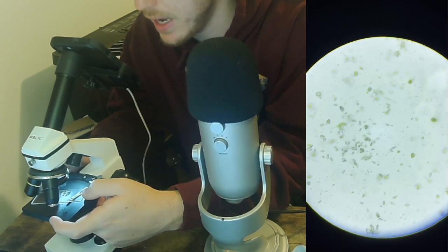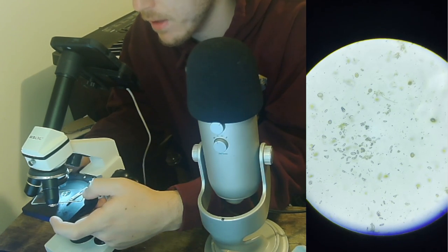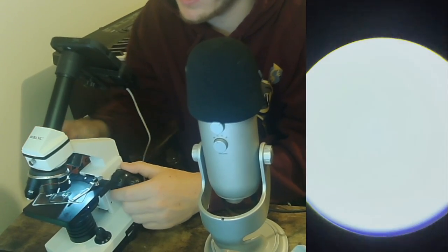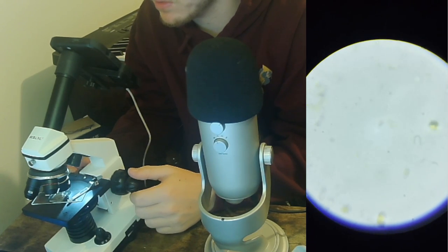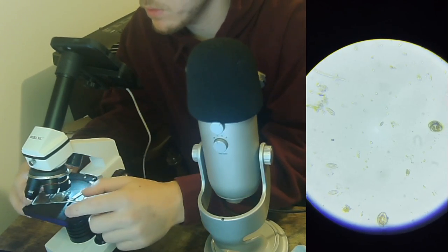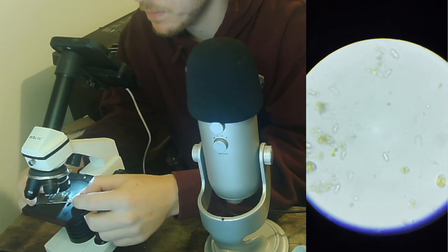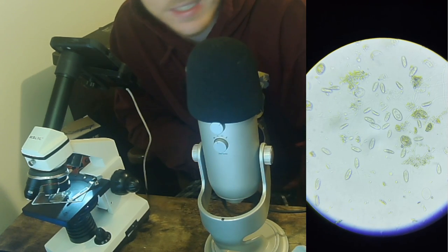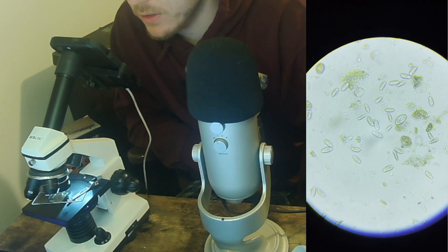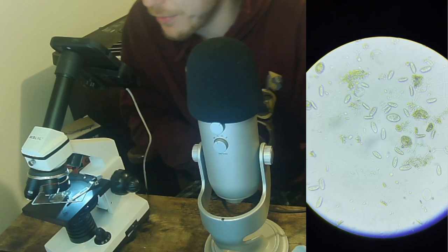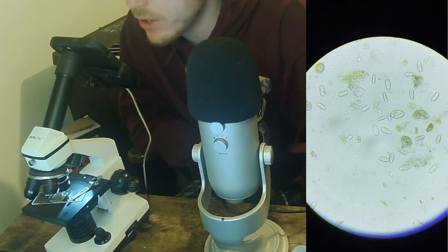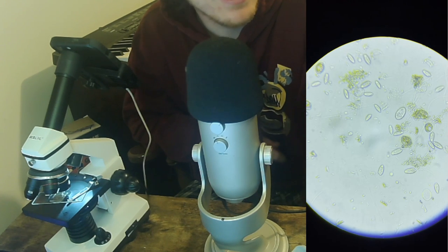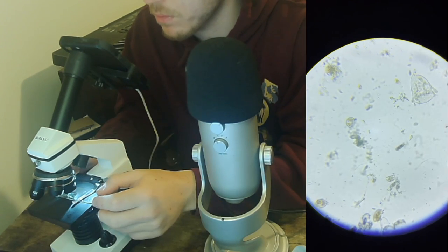It's like a freaking ant colony with how many of them there are. There's a whole giant group of friends there. Well since there's so many and they're not gonna move probably too far, let's zoom in to see them at better resolution. Look at this! Talk about activity! Look at these guys! Just a huge group of these guys swimming around. Look at how fast some of them move. It literally looks like they're teleporting. It looks like this is in fast mode. This is in real time, I swear. This is in real time.